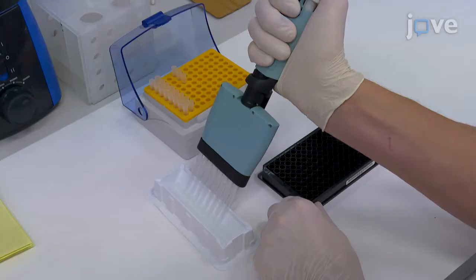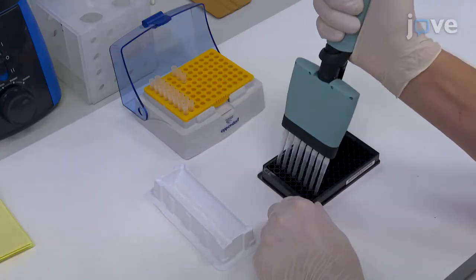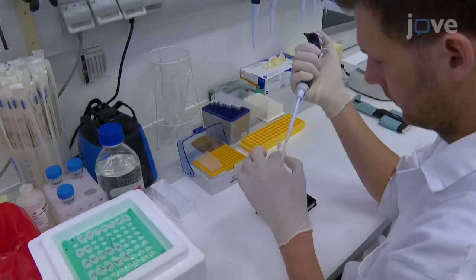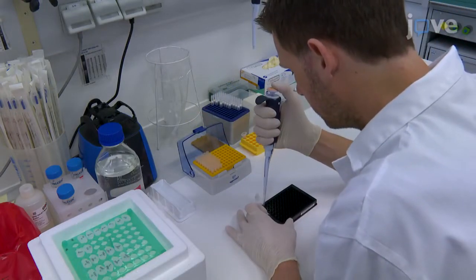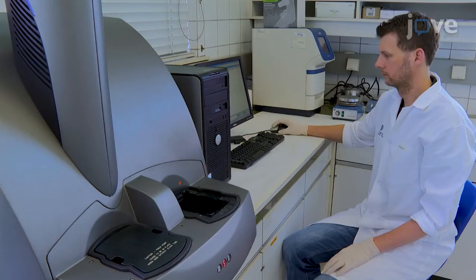The ECLEAR is a simple yet efficient method to quantify cellular levels of MeCP2. The ECLEAR is fast, more sensitive, and easier to handle compared to other quantification methods such as the Western blot and the ELISA.